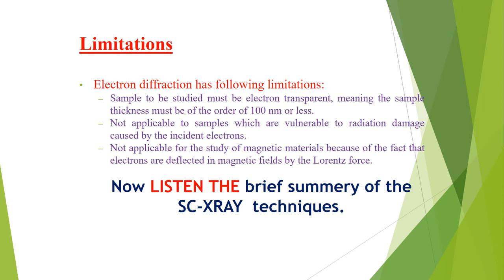Second is thin film XRD analysis. It uses grazing incidence to reduce substrate diffraction. And in the case of single crystal XRD analysis, only large crystallites are used. The diffraction condition is met at points in 3D reciprocal space.